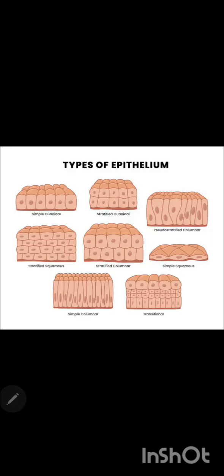First point, you should first emphasize the layers of cells of the sample tissue, meaning you need to check whether it is a single cell layer, double cell layer or multiple cell layers, or which type of tissue or epithelial cell it is.